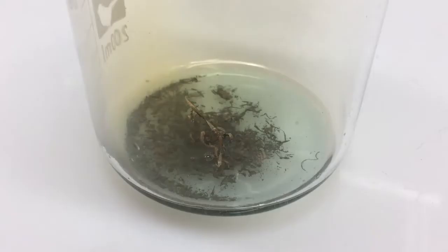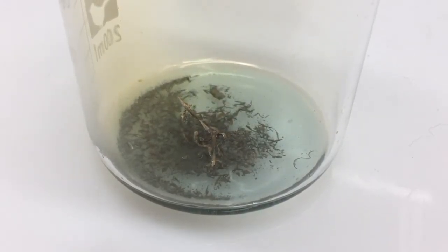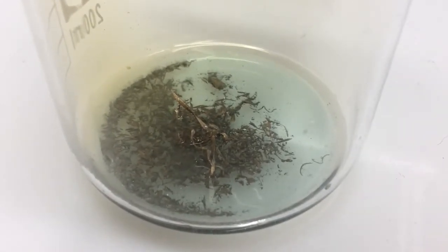The next step, after all the silver has reacted and dissolved, is to let the leftover acid and water evaporate. This can be done over time in a fume hood or over low heat on a burner or stovetop. The remnants from the solution should be a white or slight brown powder of silver nitrate.